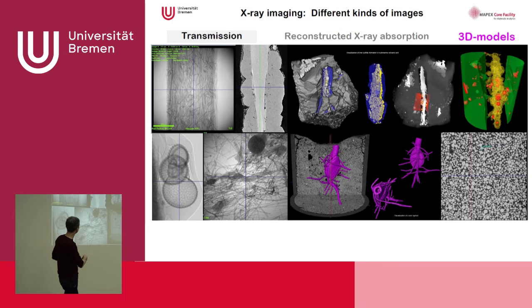So we see some porosity here. And sometimes, that's a nice thing, a corn sprout in a sand environment. Often we also have 3-dimensional models, colored nicely. And this is what happens when we look at it with digital image analysis.